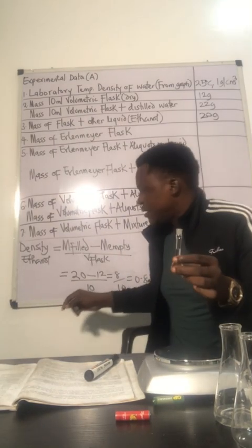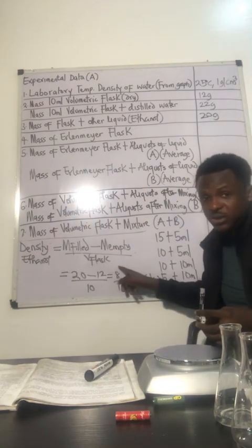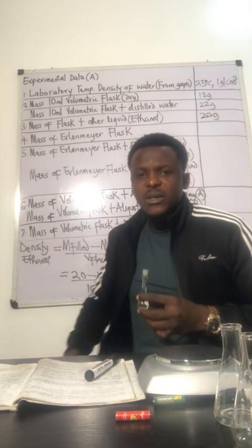Now, briefly, I did the calculations here. So if you look at this, I did the calculations here. Okay, so that is that for this third step.